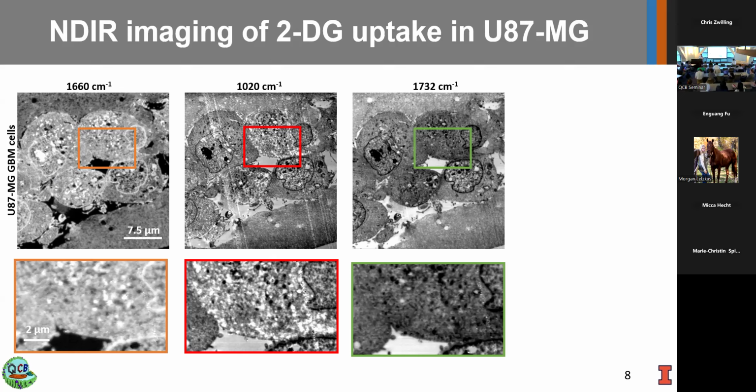But if you're looking at 10 other metabolites, the first thing to make sure is, through that protocol, do these 10 metabolites remain till the end? If not, then there needs to be some change to the original protocol to make sure they don't dissolve away. But right now, as the protocol stands, it's good enough for looking at proteins, glucose, and possibly other key bands like nucleic acids, which remain preserved.